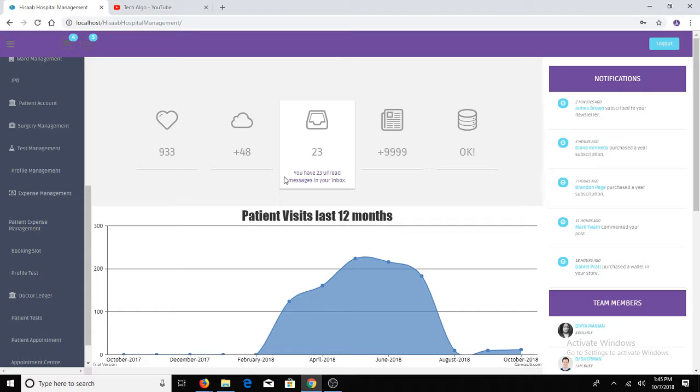My lecture today will be about the lab software. I will show you how to manage the different lab testers with our software.